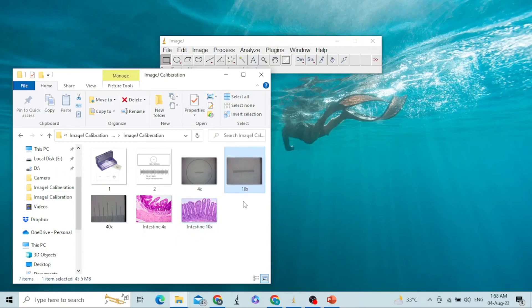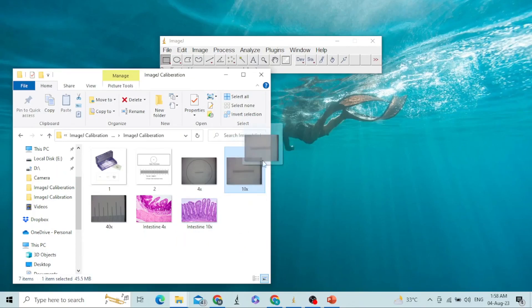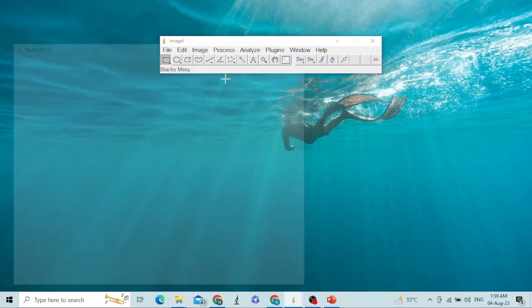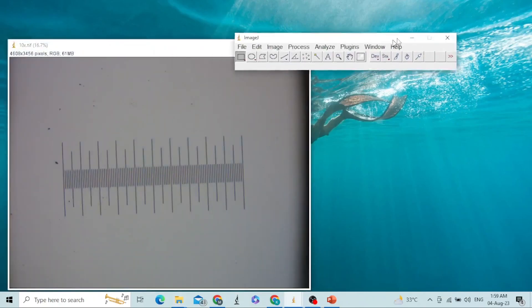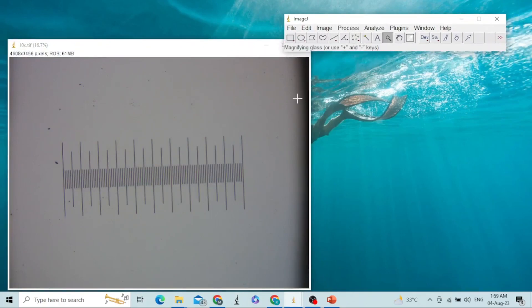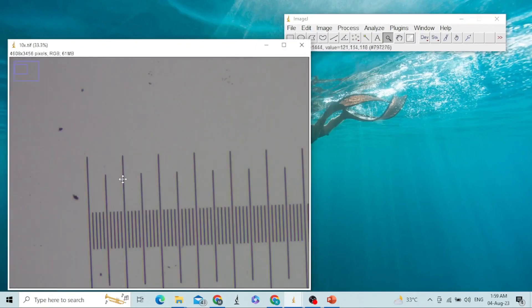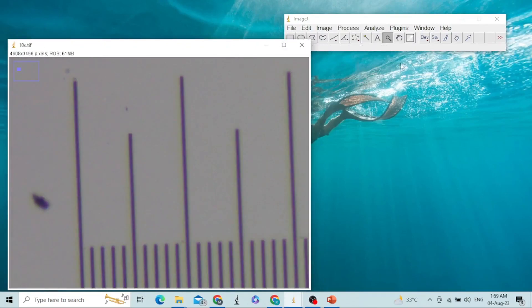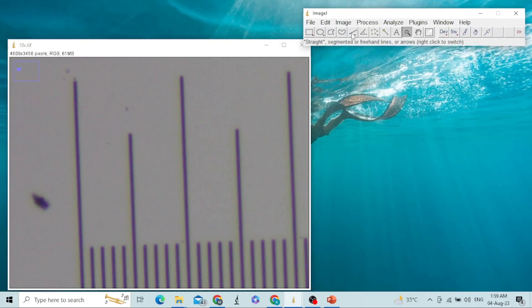I will drag this stage micrometer image and drop it into ImageJ. Now you can see the image is open. I will magnify it for ease. Then I will use this tool — the straight segment or freehand line tool.